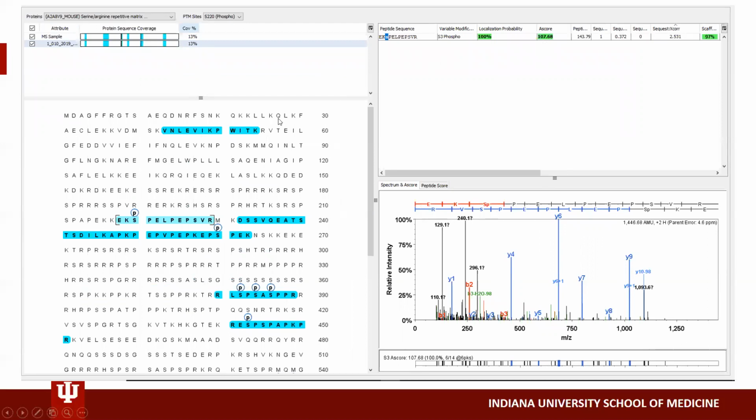Just wanted to go over another high confidence example and give you a zoom in of how the low confidence versus highly identified high confidence ions are. And that's Scaffold PTM. And so it can be a really useful tool for data visualization.